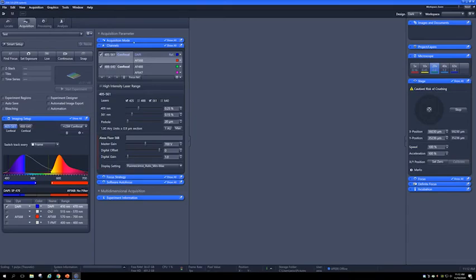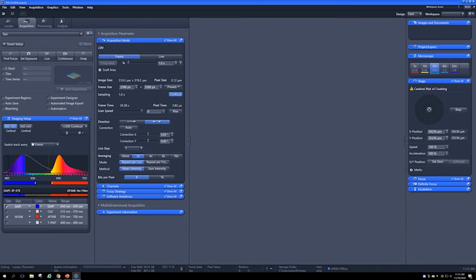Next, under Acquisition mode, select the desired scan area, which you can change while you're imaging in live mode, and select Confocal to set the optimal resolution and scan speed. For scanning direction, bidirectional imaging is fine for most cases. However, you will need to align the bidirectional scanner using the Auto button below when you begin or when you change objectives. For high-quality images, you may want to use unidirectional scanning.